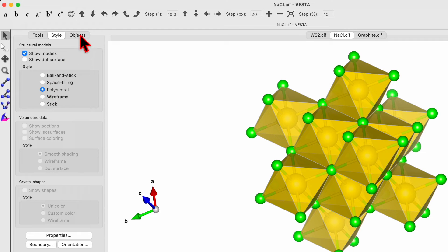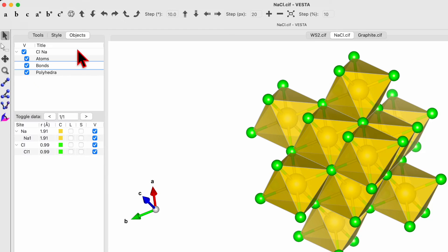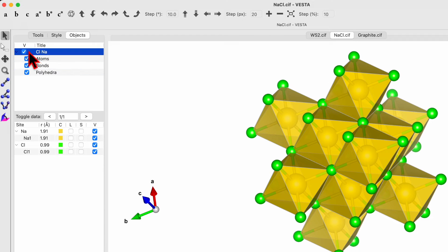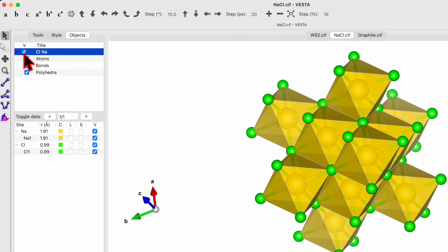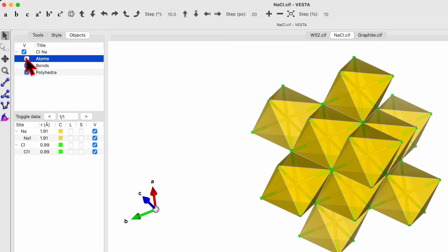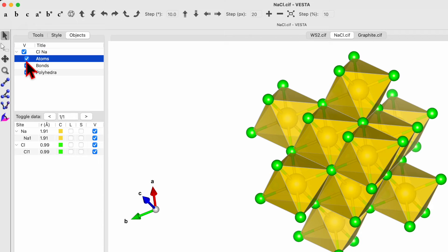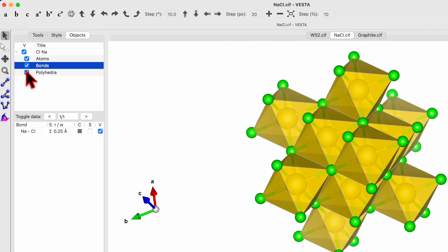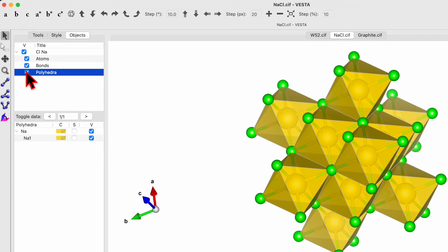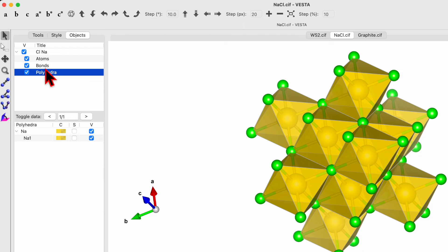So let's come back to the polyhedra. And then we'll go to the third option, that's the object. In the object, if you uncheck this box, your unit cell will be gone. If you uncheck the atom, the atoms will be gone. If you uncheck the bond, the bond will be disappeared. If you uncheck the polyhedra, the polyhedra will be gone. So this option can help you to choose what you want to show.